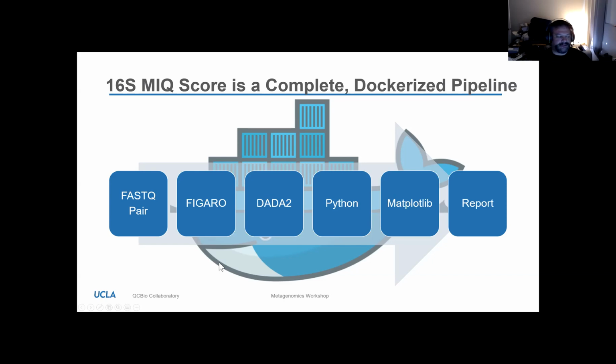And another way to design this is that it's not necessarily a Zymo-specific product. Anytime there's any standard that has known relative expected abundances and well-defined manufacturing tolerances, I can build that as a standard for this program in about an hour. It's fairly easy for me to do.